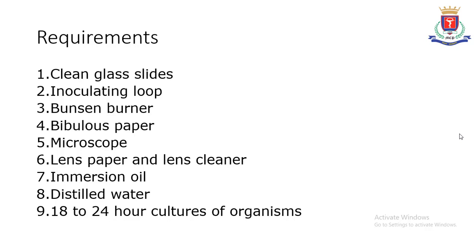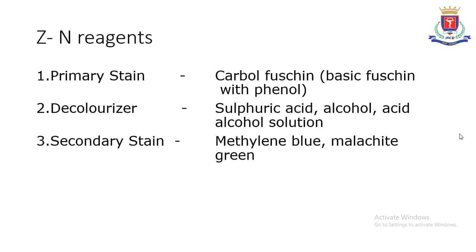paper and lens cleaner in order to clean your objective and eyepiece, immersion oil, which includes either white liquid paraffin or cedar wood oil, distilled water, and 18 to 24-hour cultures of organisms. Then the ZN reagents. The acid-fast staining method is also called the Ziehl-Neelsen method.